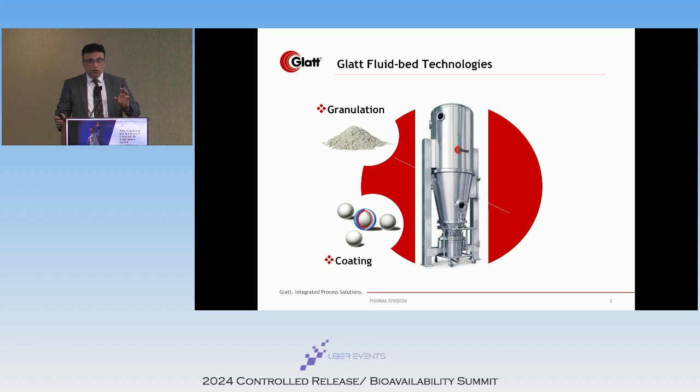We'll definitely go over each one of them individually, but having the drug loaded into a small particle and coated with different coatings that modify the drug release in vivo meets a lot of expectations for the drug release and absorption mechanism that a drug goes through, and the availability that we are looking for when it goes through the GI tract and the biological system in general.